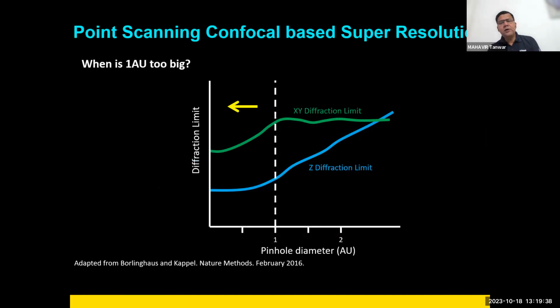So then confocal is just not restricted to just capture, as I said, images. Of course, the resolution of any optical microscope or confocal is around 240 nanometers. When I'm saying resolution, I'm not talking about filling up of pixels. I'm talking about how well they can separate the 2 points as the 2 points, right?